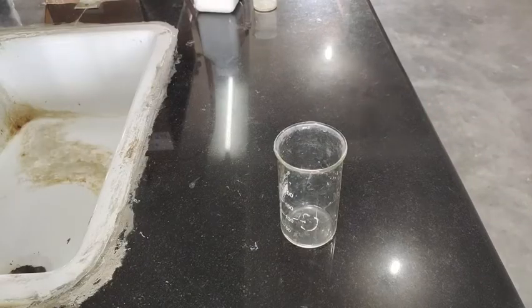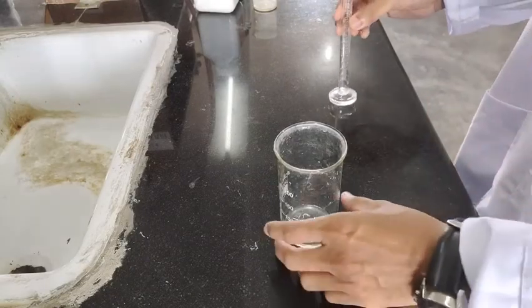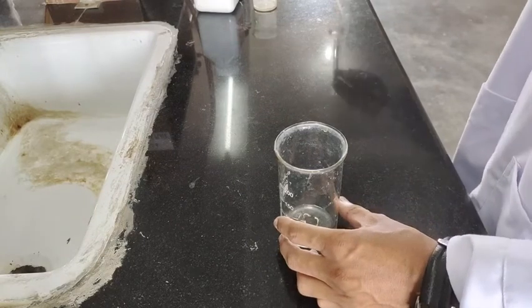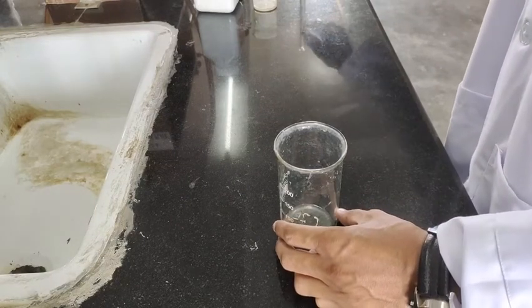Weigh accurately around 1 gram of hydrogen peroxide, which comes around 0.9 ml, and transfer it into a beaker.